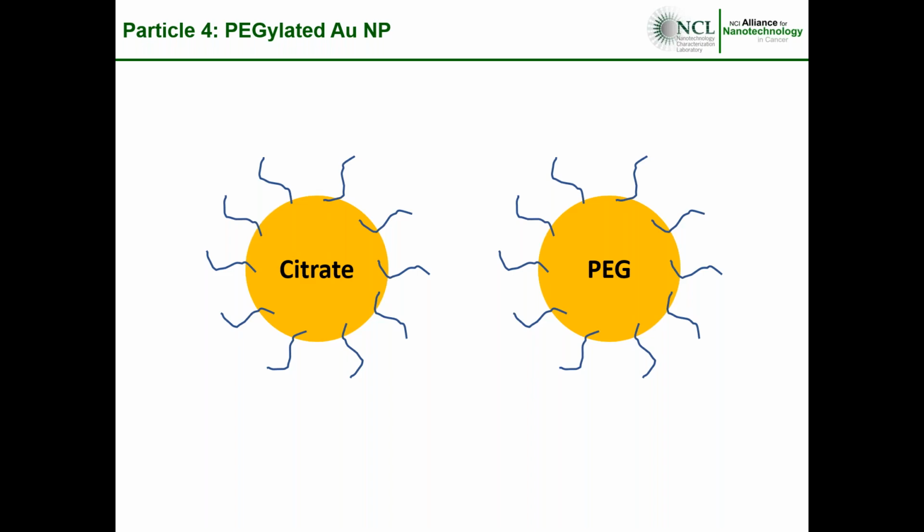So for this first part, for the concentration analysis, we're going to use pegylated gold nanoparticles. We're using the pegylated gold nanoparticles because we want to cross-compare these nanoparticles with single particle ICP-MS and some of the other instruments that we have that do particle concentration in our lab. Pegylated gold nanoparticles are a little bit more stable than the citrate-coated counterparts, just because there's an actual chemisorbed surfactant on there. And some of these other techniques use high ionic strength, which citrate-stabilized gold doesn't really like well.